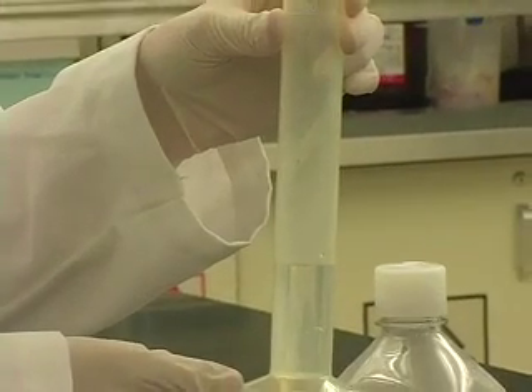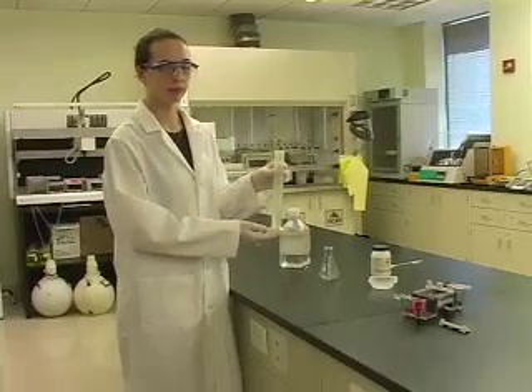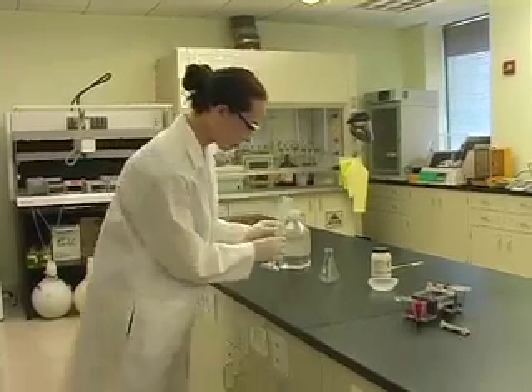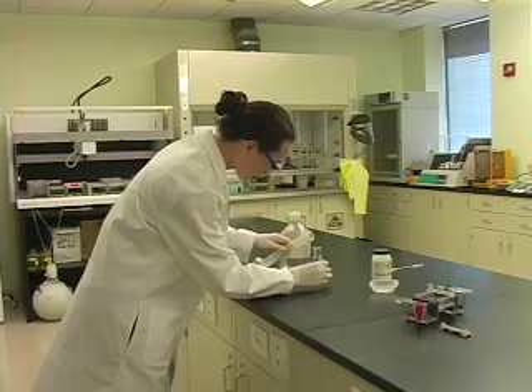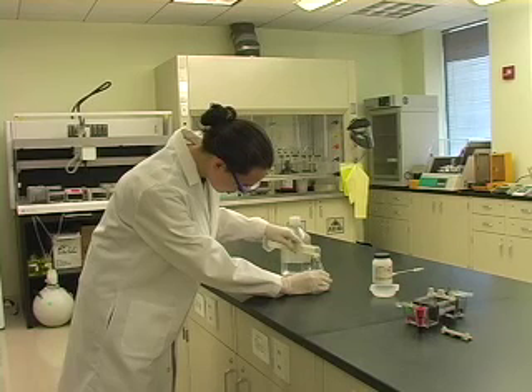To cast an agarose gel, measure out a mass of pure agarose and a corresponding volume of buffer. The ratio of agarose to buffer is calculated in advance. A higher percentage of agarose means a denser matrix. Gels are typically 1 or 2 percent agarose.